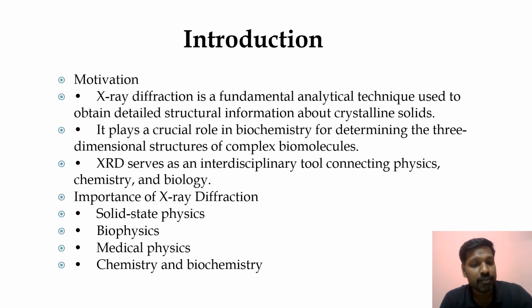XRD is used in many fields such as solid state physics, biophysics, medical physics, chemistry, and biochemistry. Whenever we want to know how atoms are arranged in a solid material, XRD is the first choice.